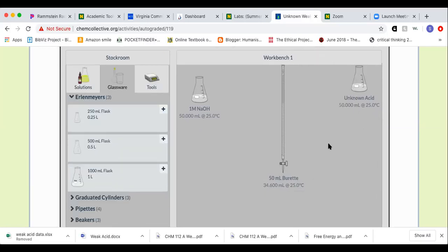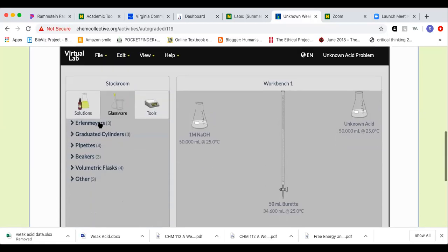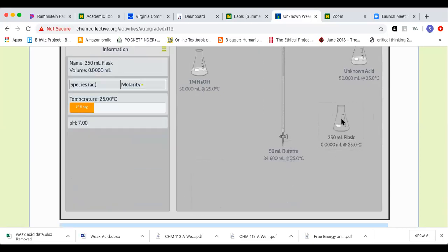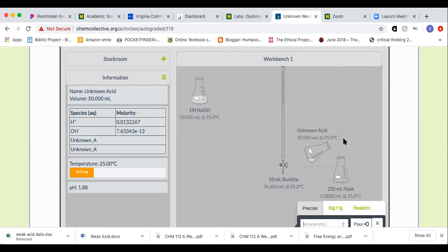When you have your graph, and you're trying to define the pKa visually from the graph based on our plot, what we may want to do is validate the actual pH. So let's say, for instance, you determine that halfway to your equivalence point is at, let's say, 3 milliliters, and from the graph it looks like the pH is like 1.5, but we want to double check that.